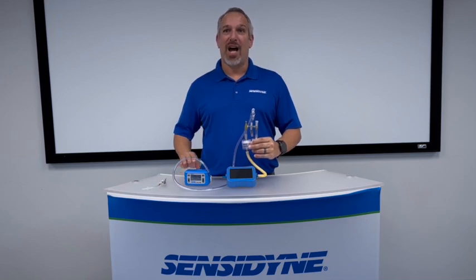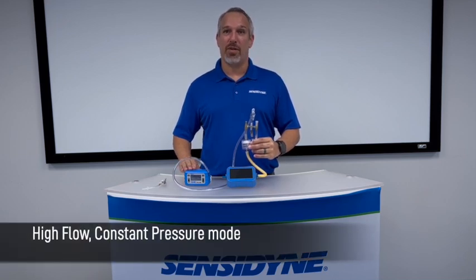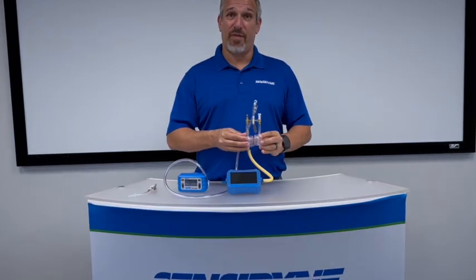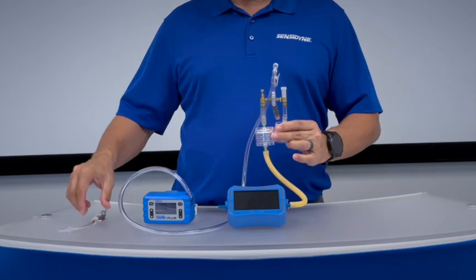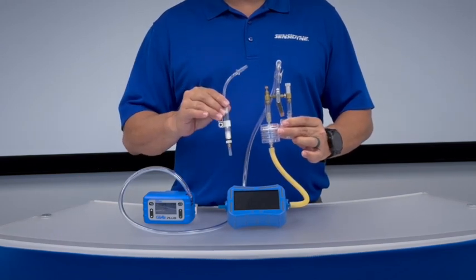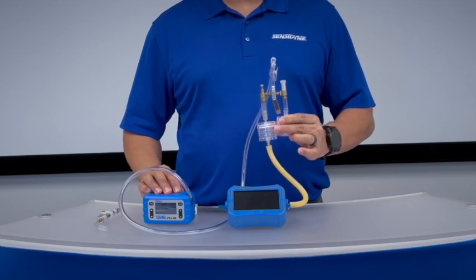We will be demonstrating two different setups today: one with a two filter cassette setup, and another using one filter cassette and one charcoal sorbent tube. Both of these setups utilize our high-flow split manifold system.